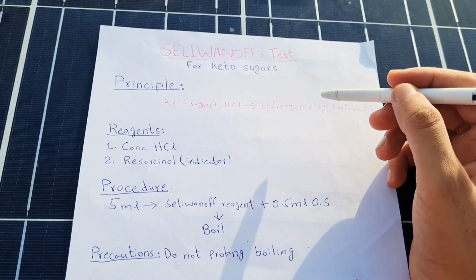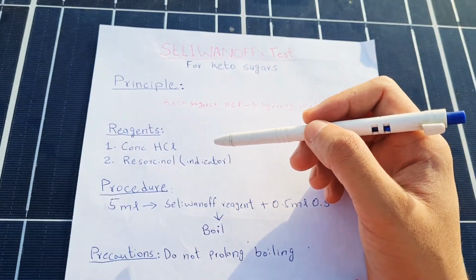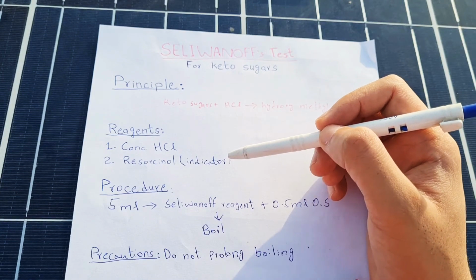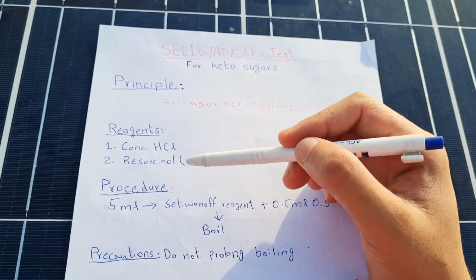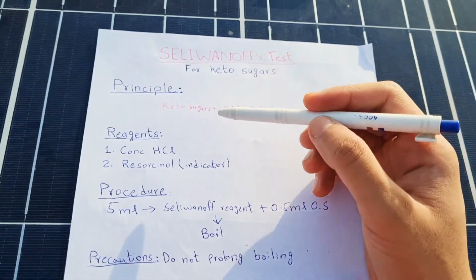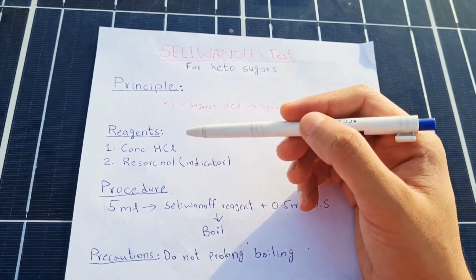So let's talk about the reagents which are used in this test. The reagents used in this test include concentrated HCl and resorcinol, which is an indicator for this test. When these two substances are combined in a particular amount, this reagent is called Seliwanoff's reagent.